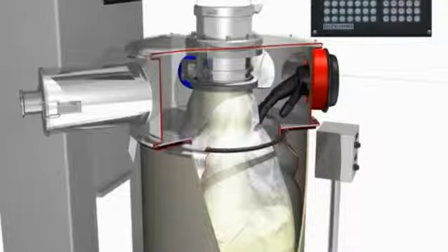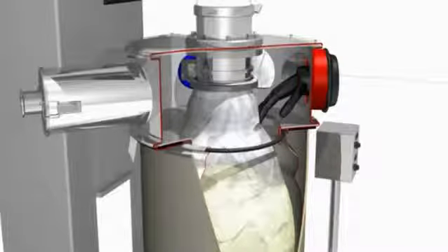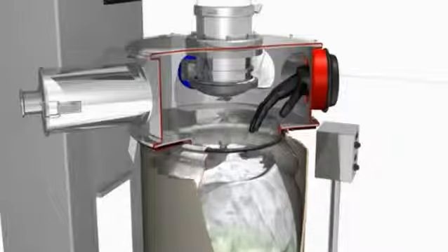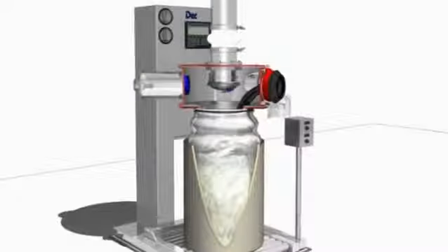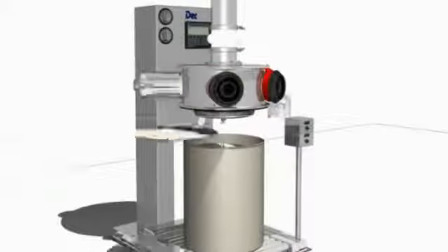This ensures the DCS is always under negative pressure to the outside environment. Because of this, it can be purged with inert gases if required. Operator access is achieved by using the two glove ports in the front of the unit with a waste bag-out port mounted to the side of the system.